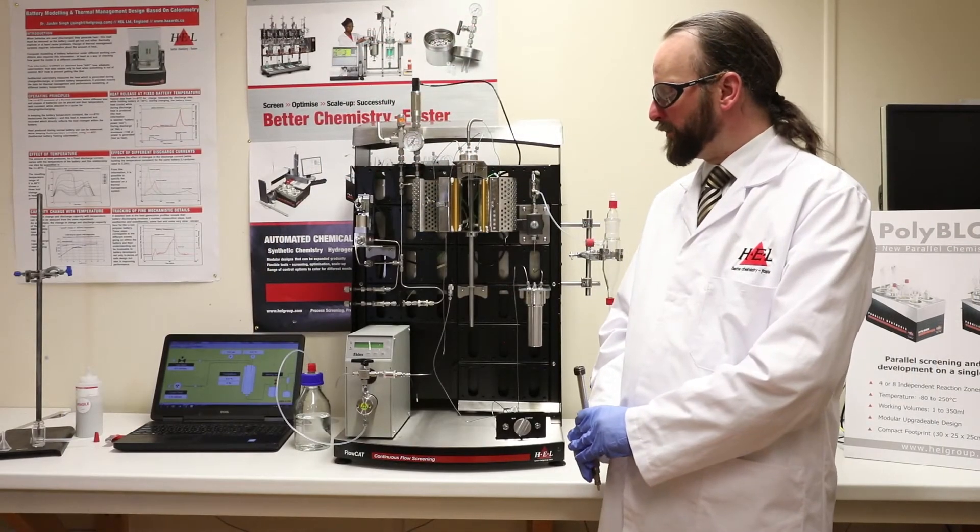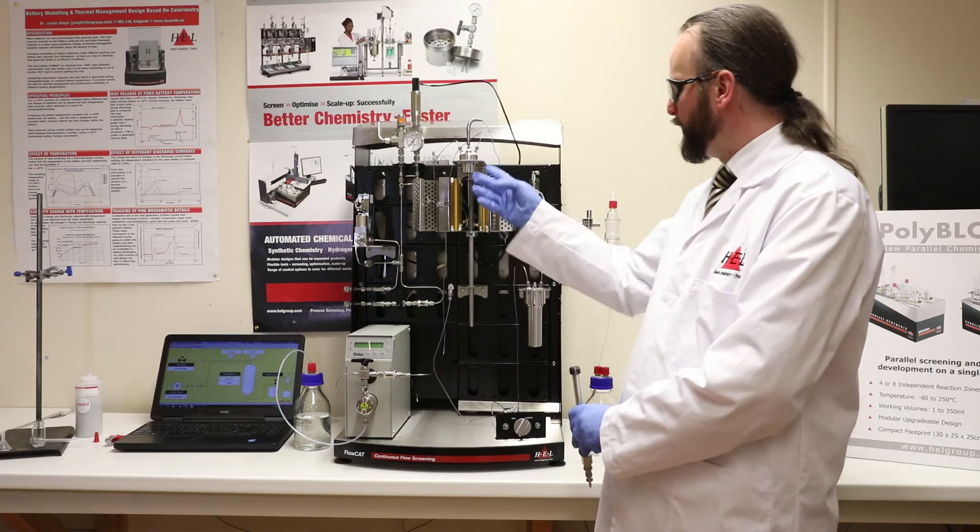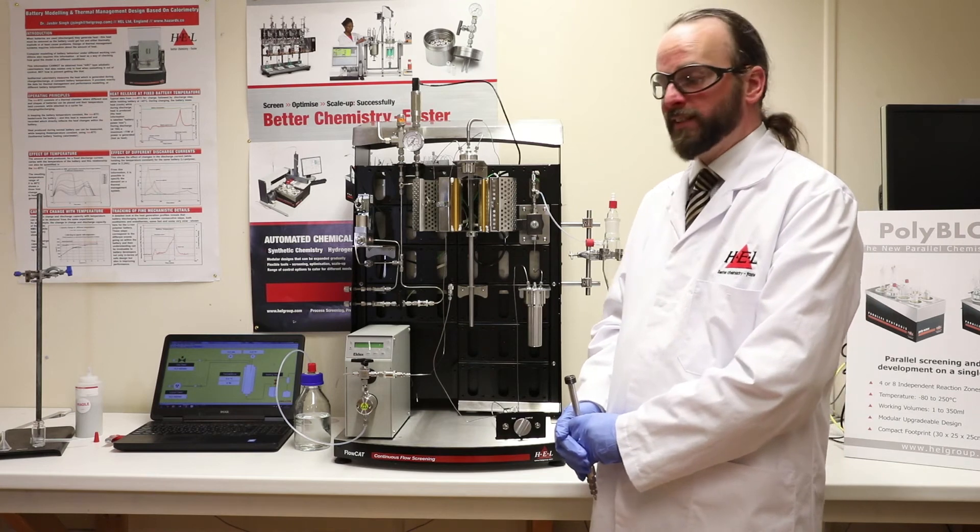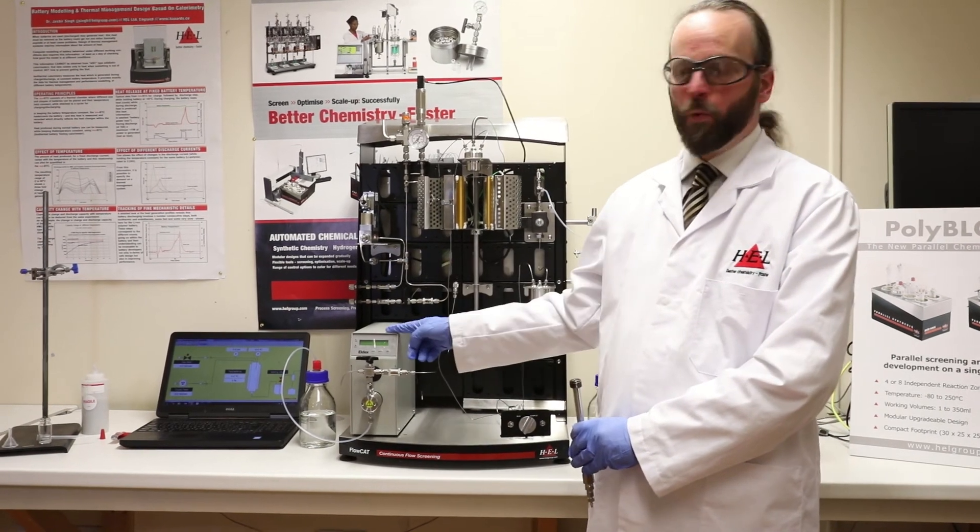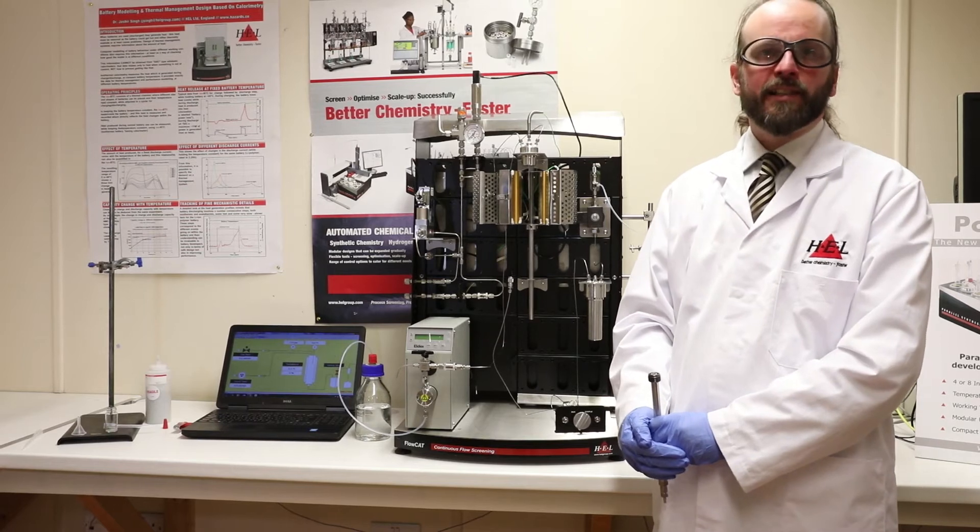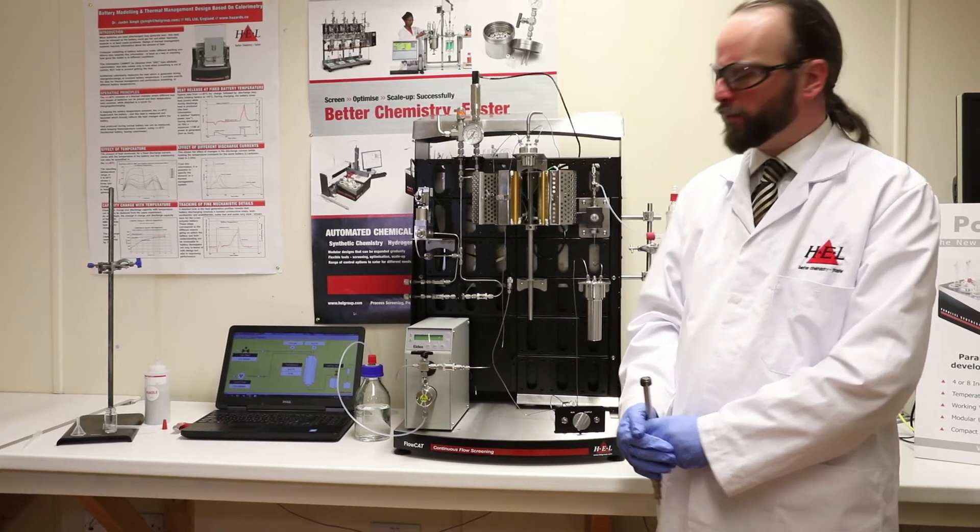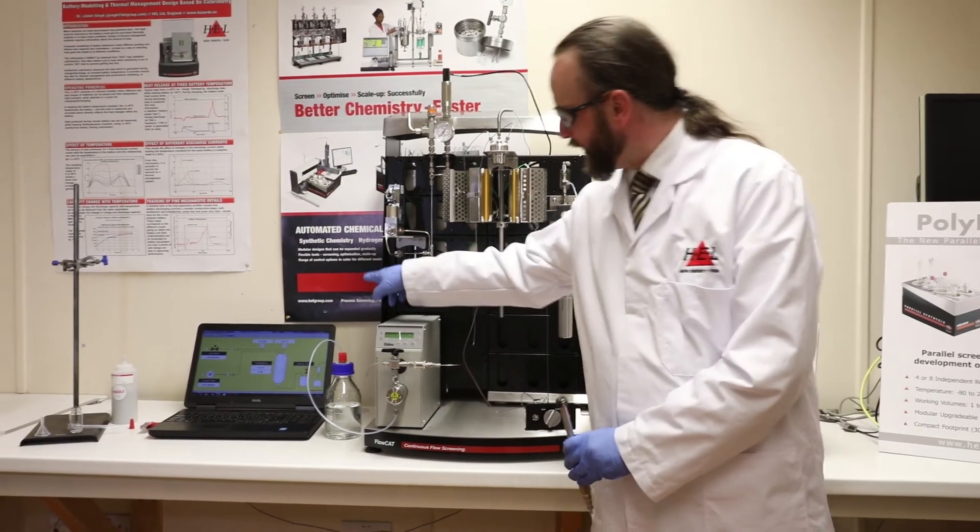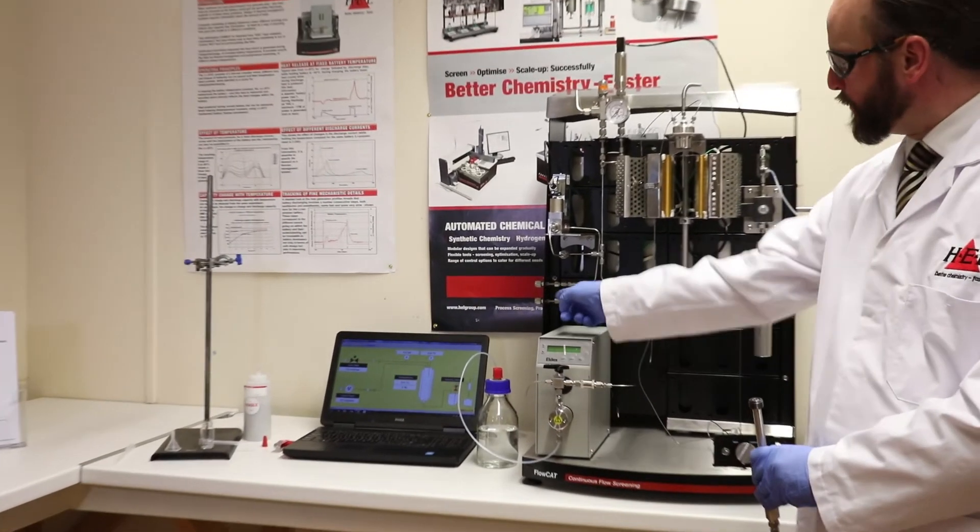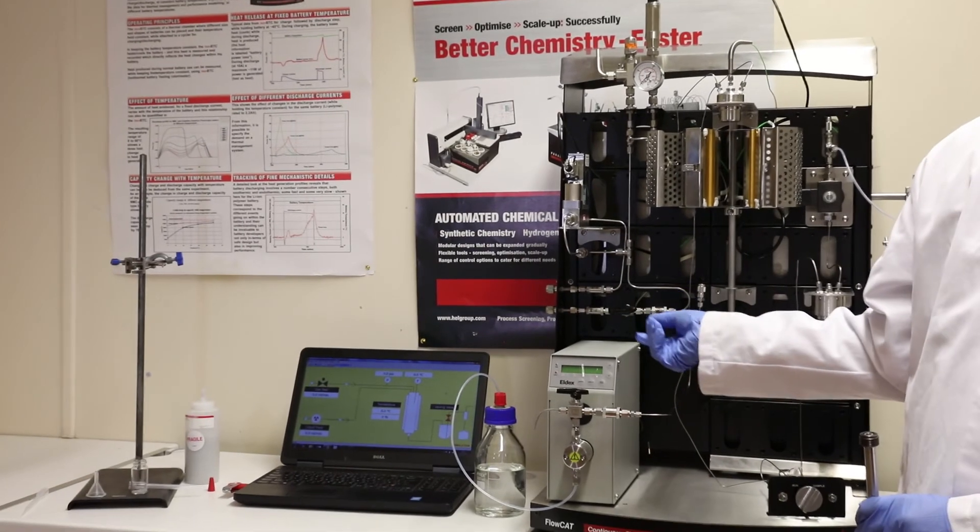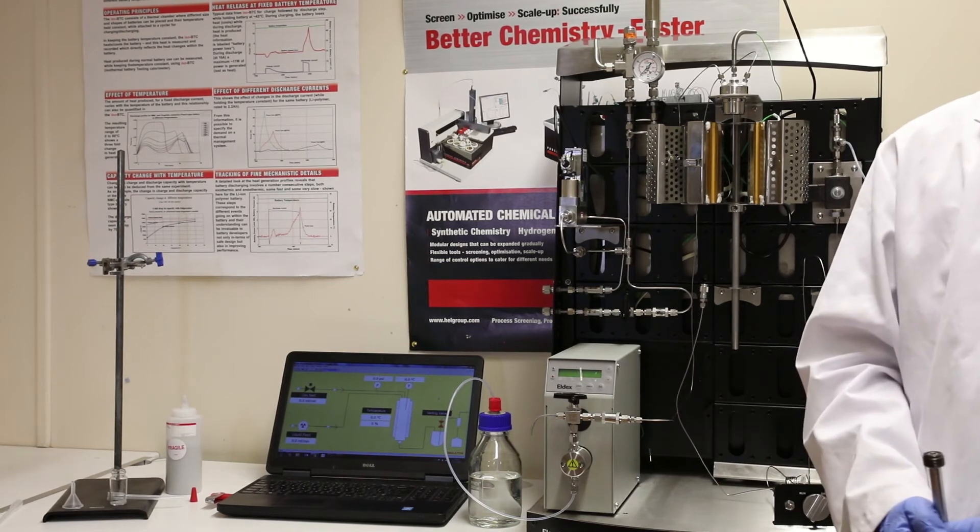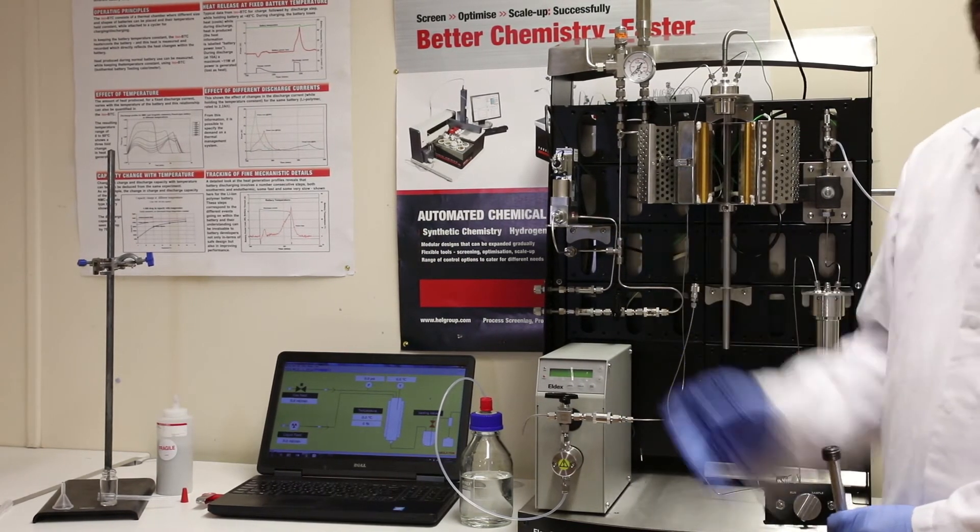So now let me take you through the system. On the left hand side here, we have the feeds, in the middle the reactor, on the right hand side, the outlet. Now on this system, we have one liquid and one gas feed, from one HPLC pump and regulated by one mass flow controller. Mass flow controller is linked to the software, so any gas can be used. You just choose which one you're using from the drop-down menu. All the gases come in through these bulkhead fittings here. So this one is the reactive gas and this lower one here is for a purge gas. We've got a ball valve here, so you can easily purge with nitrogen at the beginning and end of your reaction. If you want to use more than one gas feed or more than one liquid feed, we supply more pumps or more mass flow controllers.